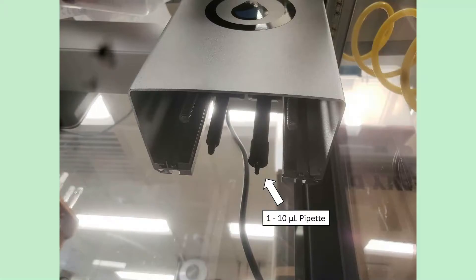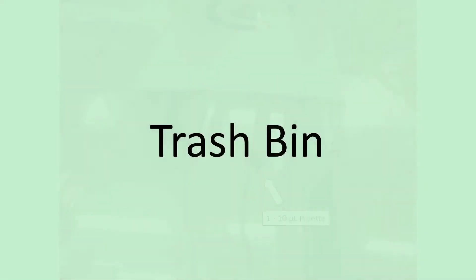The two pipettes complement each other really nicely. With the larger 300 microliter pipette you can move a large volume of liquid right away, and then the 1 to 10 microliter pipette can top it off to whatever exact volume you're aiming for. That's the pipette carriage.